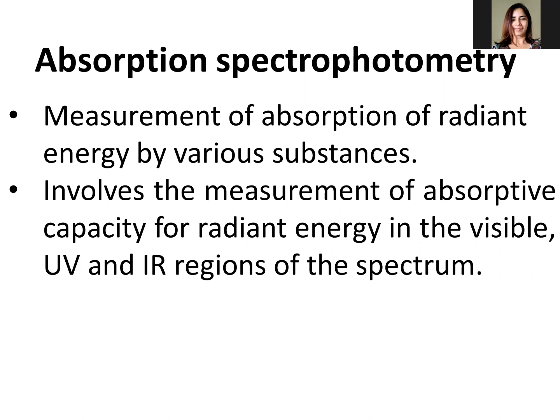When the molecule absorbs ultraviolet or visible light, its electrons get promoted from ground state to higher energy state. In the ground state, the spins of electrons in each molecular orbital are generally paired. While in case of higher energy states, if the spins of electrons are paired, then it is called singlet state.